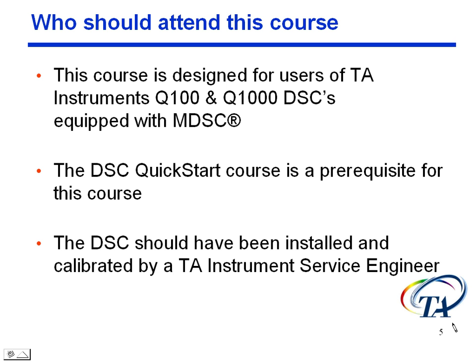The DSC QuickStart, or appropriate knowledge, is a prerequisite for this course. What we mean by that is that you've run the instrument for a period of time, you know how to get through the software, and you know the basics of DSC, because I'm not going to explain all those little basics. Those were explained in the DSC QuickStart. And obviously, you should have had the DSC installed and calibrated by one of our service engineers. That way you've run some basic DSC, maybe even some modulated runs, and then maybe this will make more sense to you.